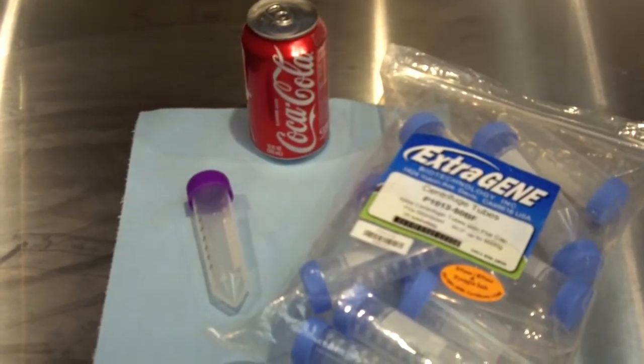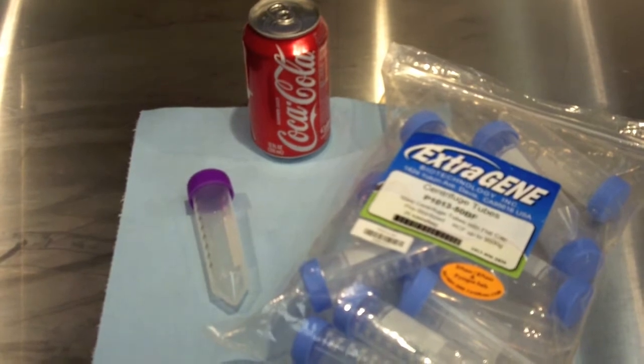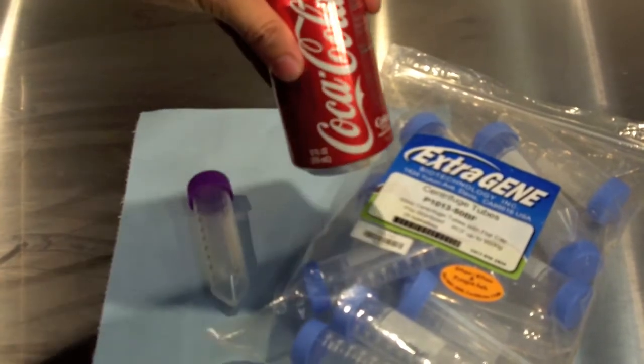What we are going to be doing today is testing how well a centrifuge tube seals against pressure. A very quick and easy test you can do in your own lab is to simply use a can of Coke.